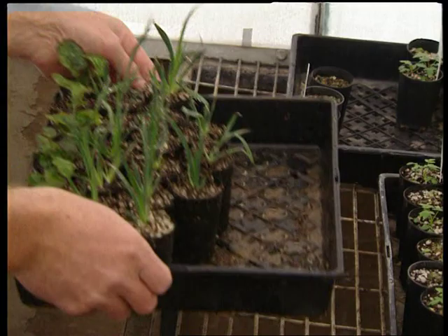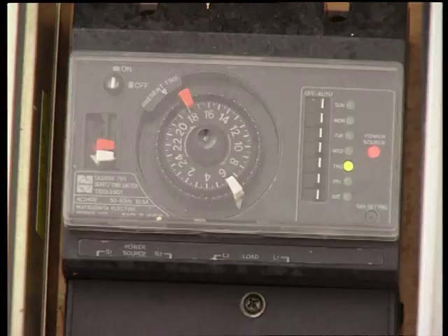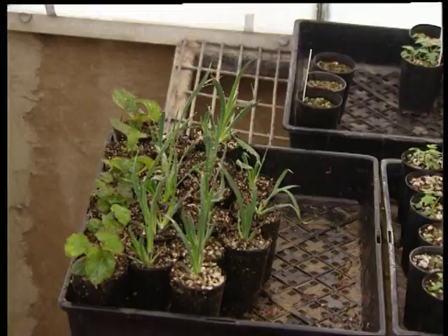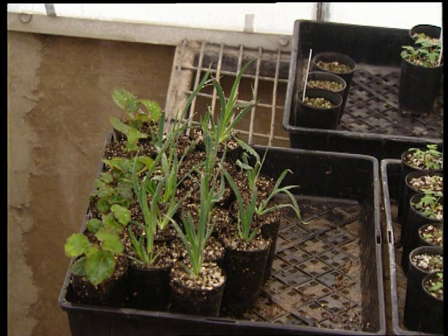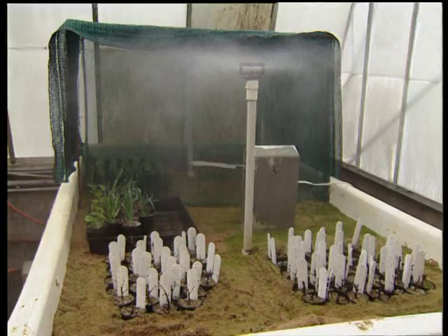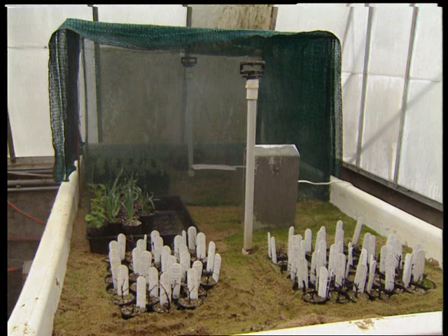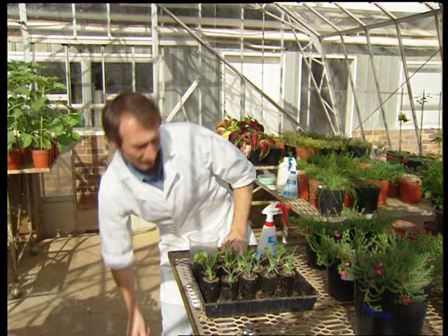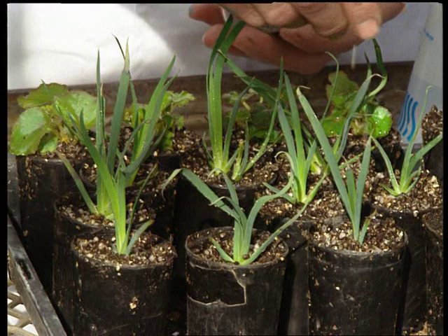The temperature in the glasshouse should be maintained as close as possible to that of the growth room where the plantlets come from. Nutrient of the potting mix is another limiting factor. To play it safe, do not provide any nutrient in the potting mix until plantlets have been removed from under the mister. This could be about 2 to 3 weeks, after which time a slow-release fertilizer, such as Osmocote, can be added to the pots.